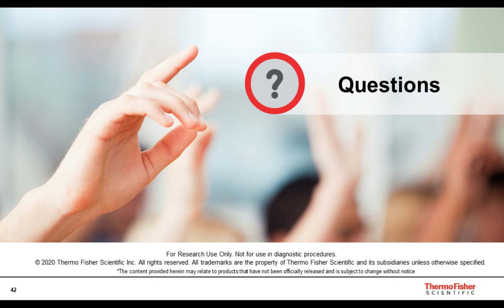Exactly. A lot of what we talked about in those screenshots is that we're really trying to help users orient themselves in the genome so they can make a specific edit. We've anchored that a lot around the exon-intron boundaries. So if we are going into a non-coding region, we don't have those same landmarks and orientations to put the user in. So we're trying to figure out the best way to solve for that, and once we come up with that, we'll be able to support that kind of edit type.